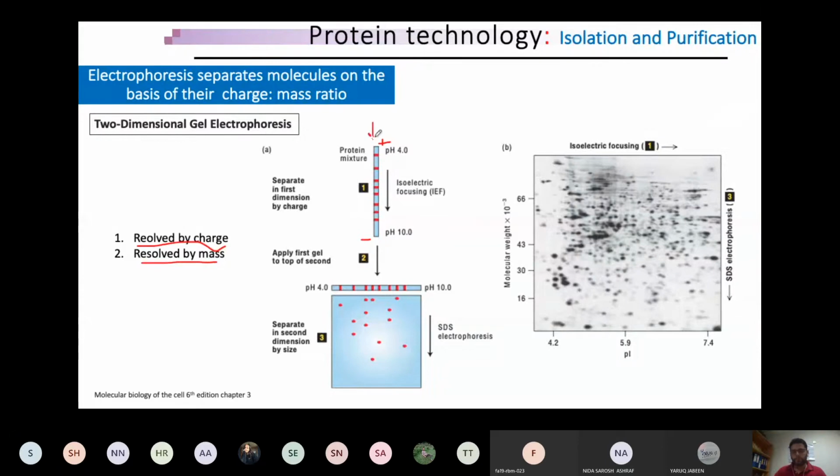If you have a protein loaded onto this strip, all the proteins will migrate from top to bottom, and wherever there is a neutral pH, they will stop. You see, there is one pH at one end, and a different pH at the other end, and whatever the isoelectric point of a protein, it will stay there.